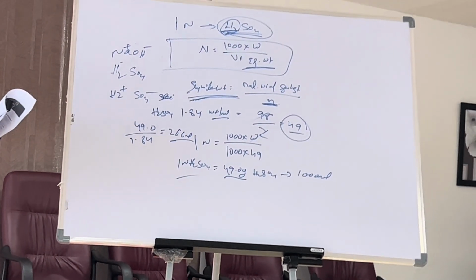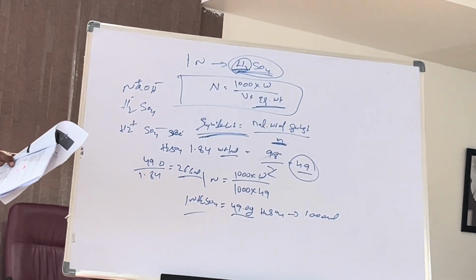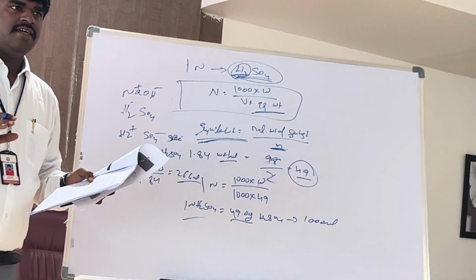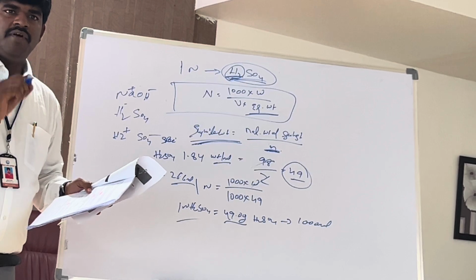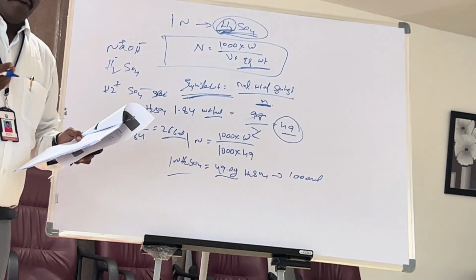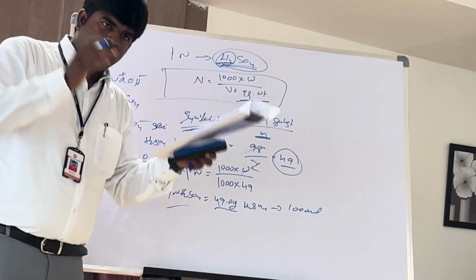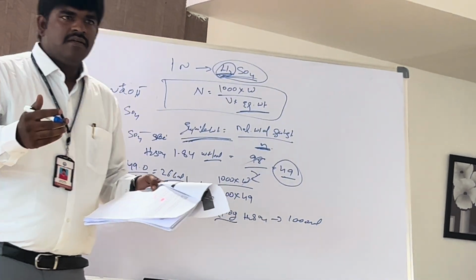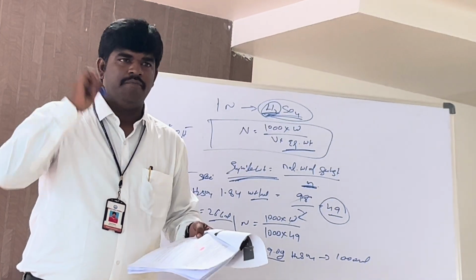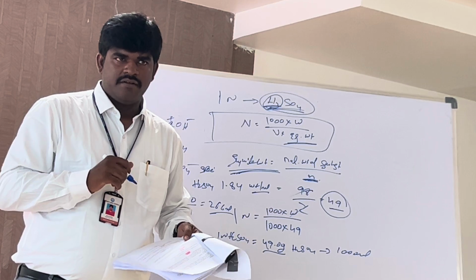If any substance is available in liquid form but you need to take it in grams, in those cases simply divide the weight by the weight per ml. In a similar way, if your product is in solid form but you need to take it in ml, simply multiply with the ml you require.